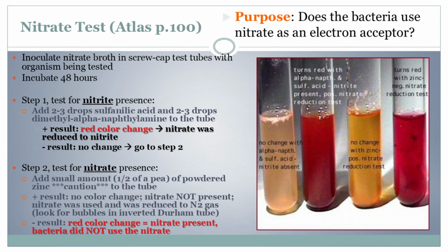Exactly. If those bacteria have been using nitrate, the broth will turn a bright, telltale red. Red means busted. We've got a nitrate-reducing bacteria on our hands. You got it. But here's where it gets really interesting. What if the broth doesn't change color? So no red, no nitrate reduction. Case closed, right? Not so fast. It might mean our suspects are trying to hide their nitrate-munching activities. Sneaky little things. So how do we outsmart them?